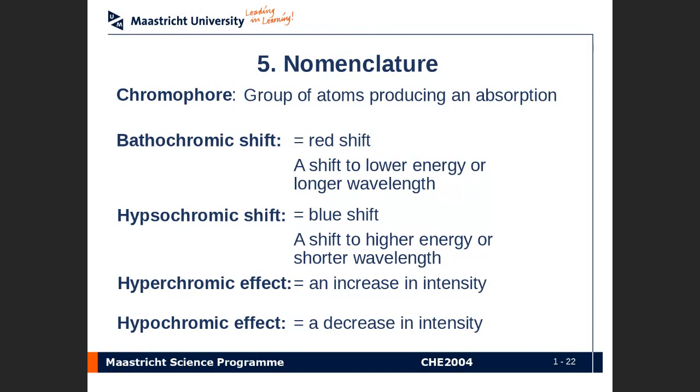specifically bathochromic and hypsochromic, right? Because if you're discussing, let's say, a series of compounds that are somehow related in a chemical family, and you want to discuss the progression of the data, then very often you'll see, by tweaking functional groups and things like that, that you'll have a red shift or a blue shift. And that tells you something very important about how, by changing the structure of the compound, you're changing these energies and therefore the position of the absorption.